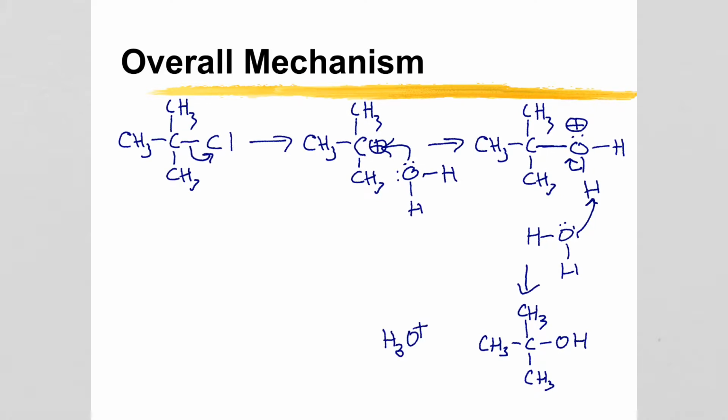the hydronium ion, which is going to be equal to the concentration of HCl. And that's really important in this reaction because this is the concentration that we're going to be monitoring in order to figure out what the rate of the reaction is.